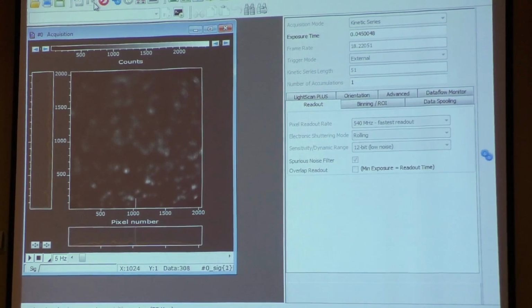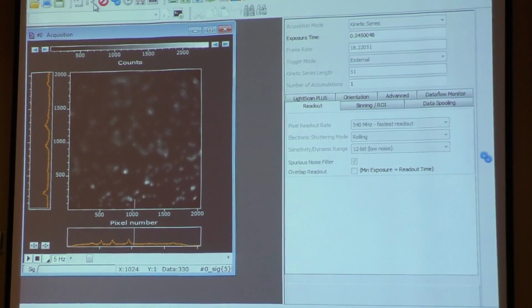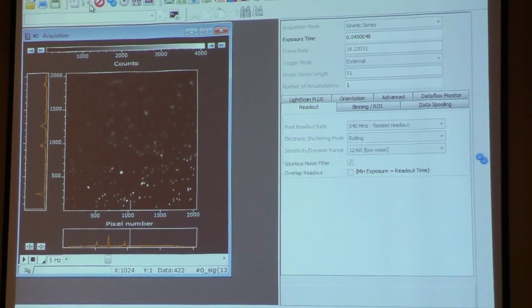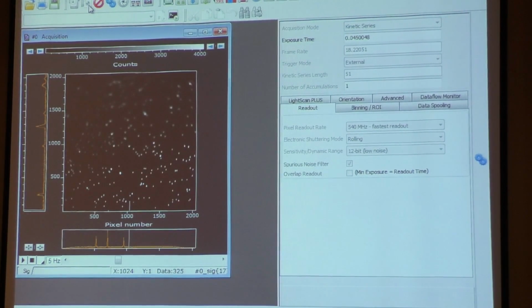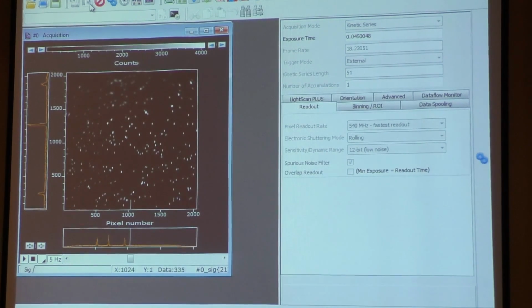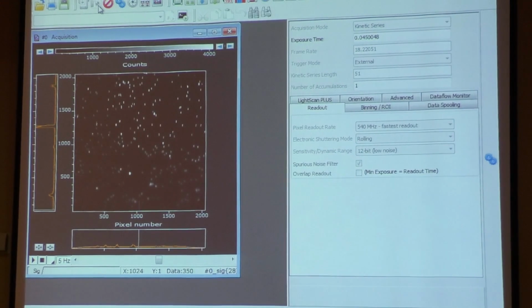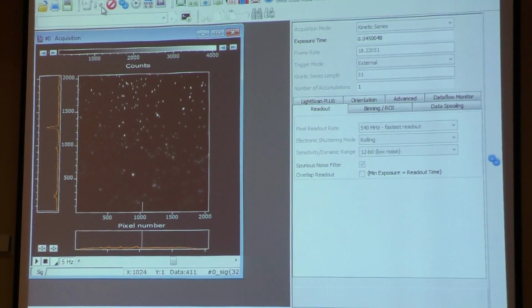And you see on the oscilloscope in a moment, hopefully, that there is a signal of triggers, and that makes the stage or the objective go up, and we see how it steps through. Okay, that most people somewhere have heard about. But what can we learn with it? And how do we get these data out, right?